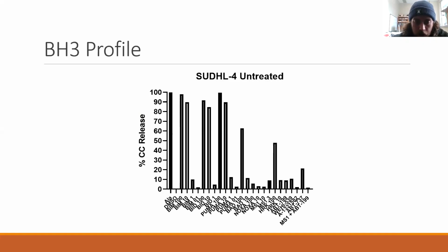And then we look at the response of our peptides. So you see a little bit of a dose-dependent response for BIM and BID, as well as PUMA. So this is a good response, indicating that when this cell is exposed to activated forms of BID, BIM, or PUMA, usually this cell line undergoes apoptosis, and we consider it rather primed. It doesn't have a large response necessarily to any one specific single inhibitor, but it does show some response to some peptides or drugs that inhibit multiple anti-apoptotic proteins.